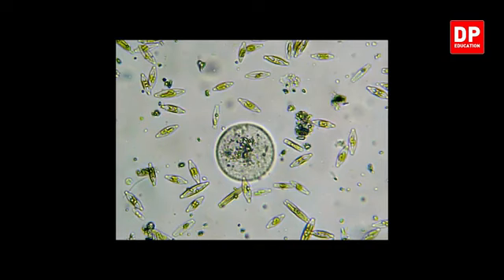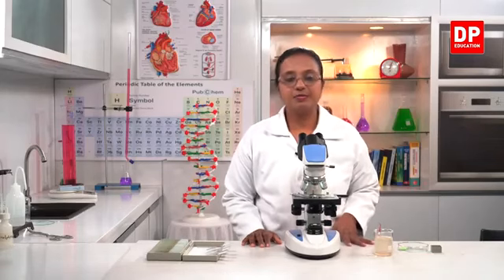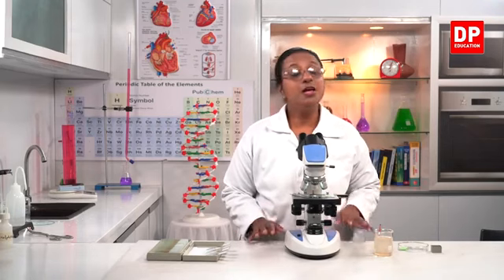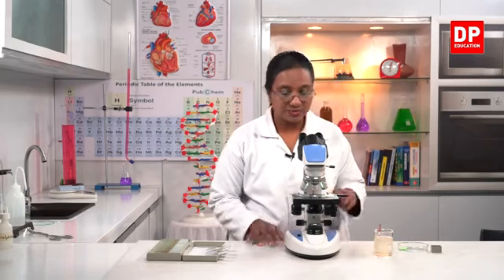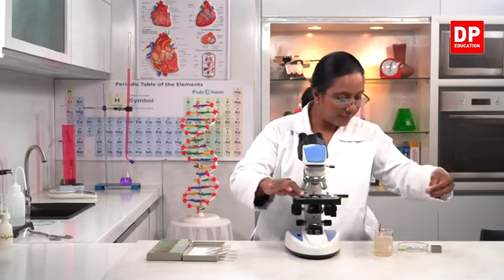So here when I observe, I can see some microorganisms. You can see unicellular structures. So students, in a water sample like this, you can usually observe amoeba or paramecium. Those are the unicellular organisms or microorganisms that are usually present in pond water. So in this also we can observe the unicellular organization of organisms. So after that, I will remove this slide. This is the temporary slide I prepared.